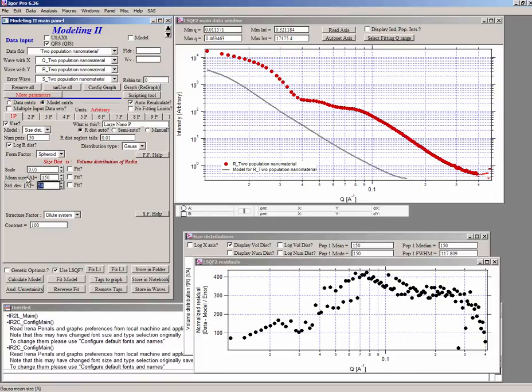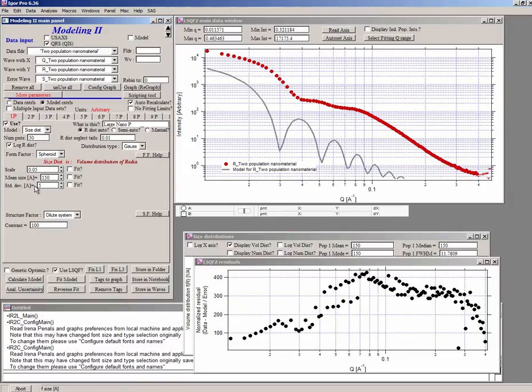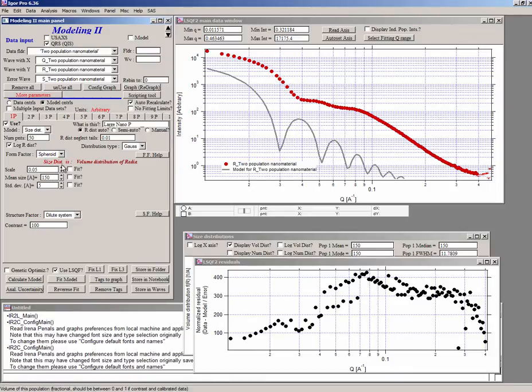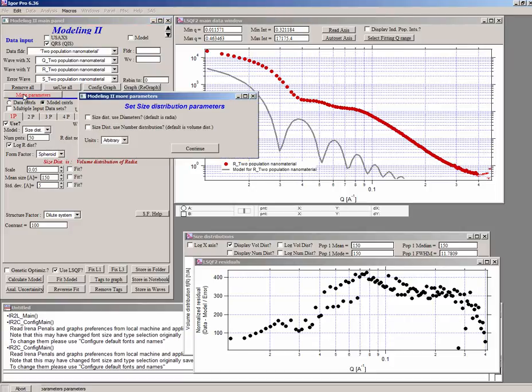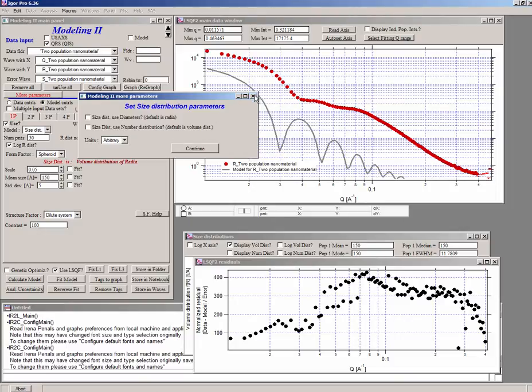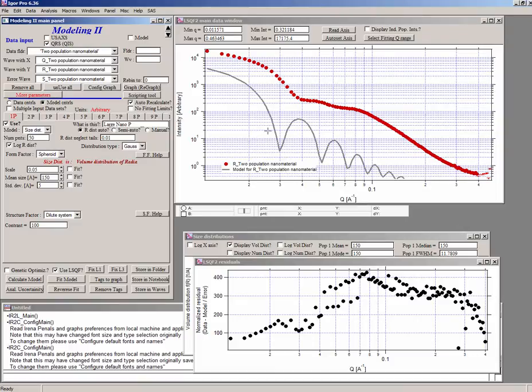What we have for Gaussian, we have a mean and we have a full width at half max or standard deviation. Those are similar parameters. They're linked together. So let me make the population relatively narrow. I'm going to make it 5. And what you see is if this was a 150 angstrom particle. And notice we are modeling volume distribution of radii. So this mean size now is a radius. You can change those things in more parameters. You can model diameters and you can model number distribution. In our case, it doesn't matter. But it's important to know what you are doing and think about that correctly.